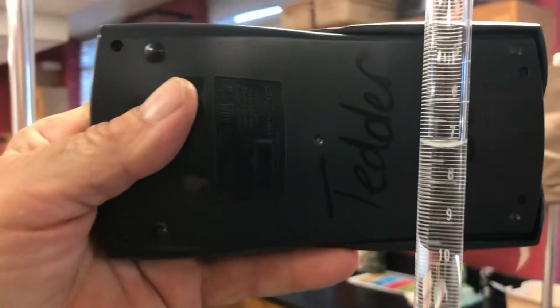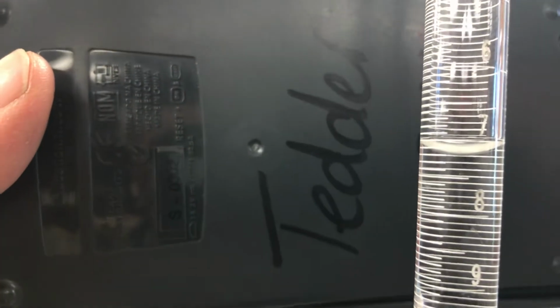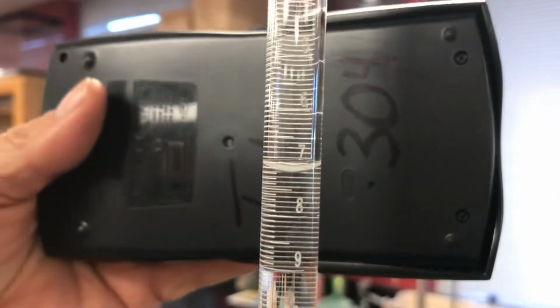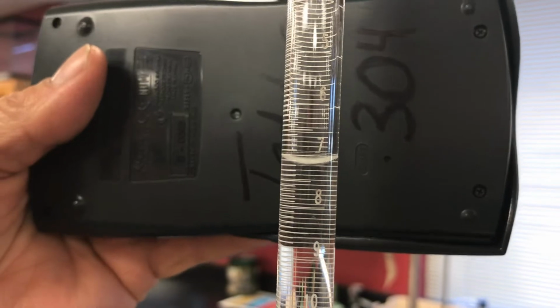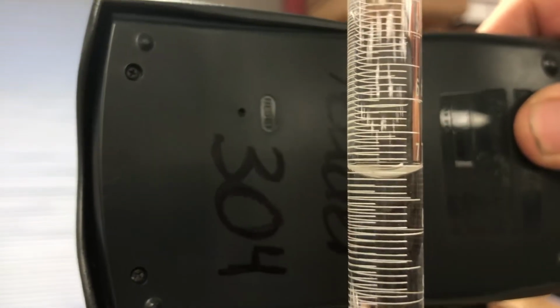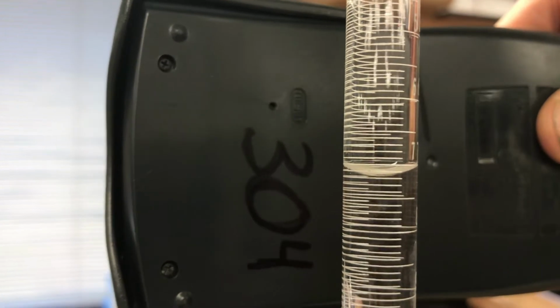Okay, so let's see what our volume is. Can we read it? So just over 7? It looks to me like 7 point... Oh no, lights turned off in the room. Can I switch sides with you so we can see the lines? 7.20. That's fine. 7.20.